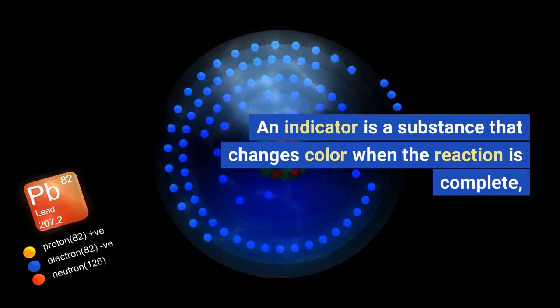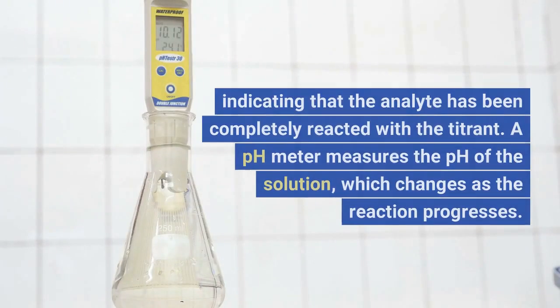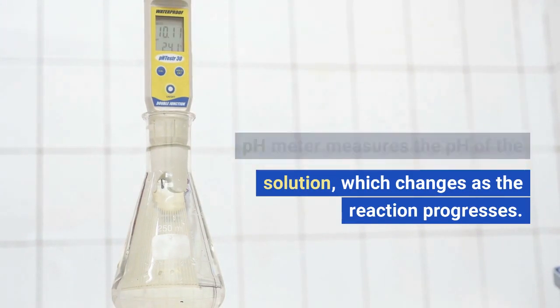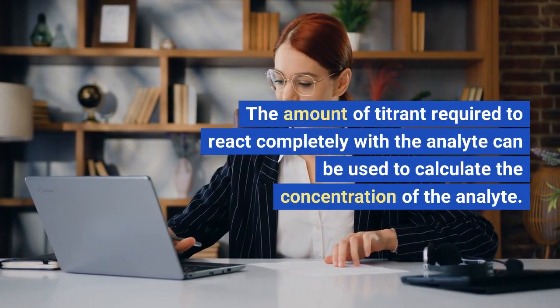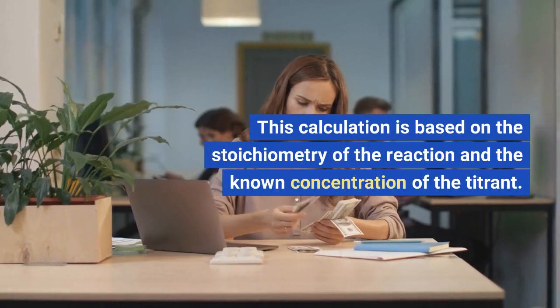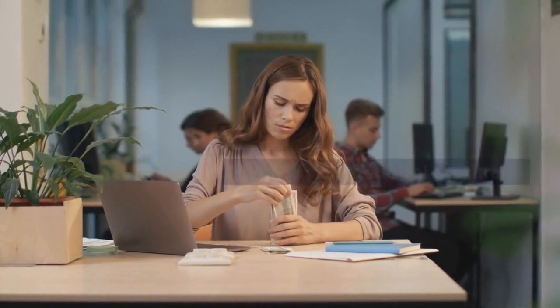An indicator is a substance that changes color when the reaction is complete, indicating that the analyte has been completely reacted with the titrant. A pH meter measures the pH of the solution, which changes as the reaction progresses. The amount of titrant required to react completely with the analyte can be used to calculate the concentration of the analyte. This calculation is based on the stoichiometry of the reaction and the known concentration of the titrant.